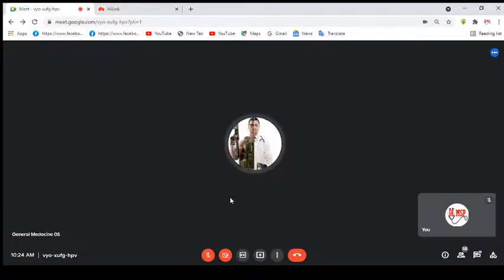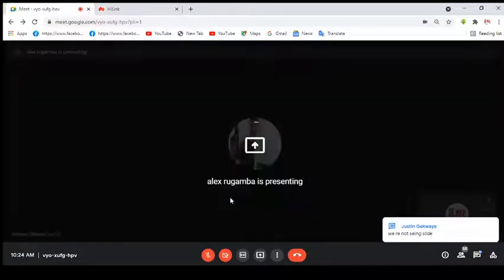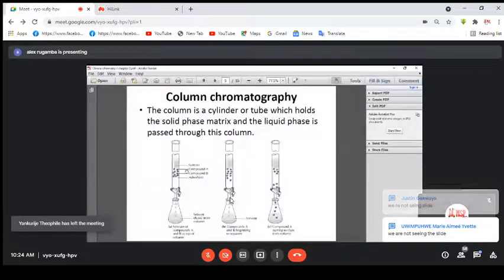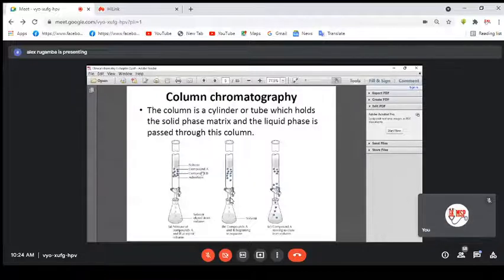So we can see your slide. You see these tubes. This column is the stationary phase. So our solution, our mobile phase, contains A and B solute. No, A and B molecules. So A is blue and B is black. So this is image one.